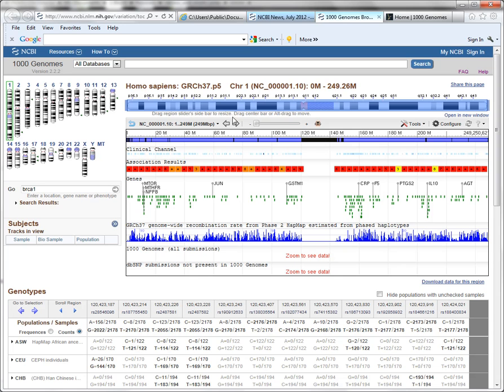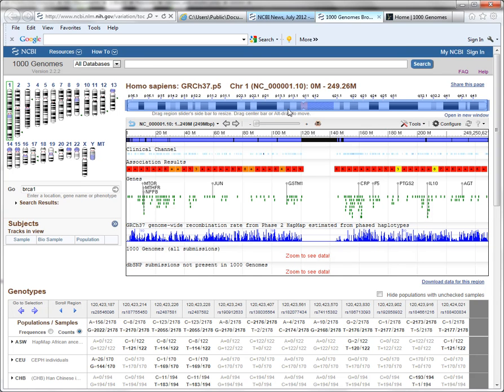Along the top here is the chromosome overview widget. This will display the chromosomal area that you're looking at, and again, we're looking at all of chromosome 1. Below that is the NCBI Sequence Viewer.